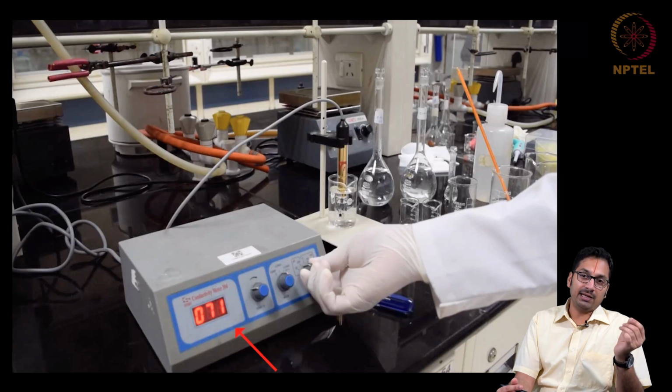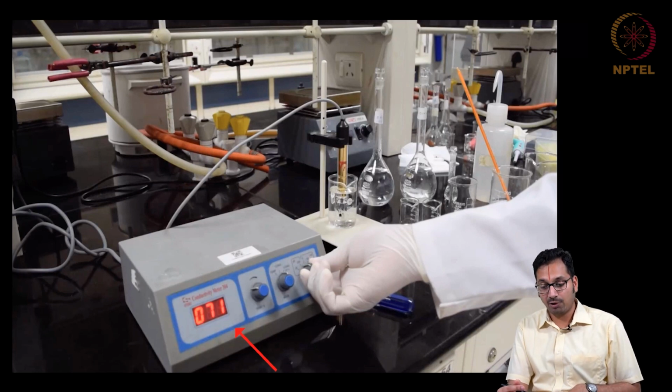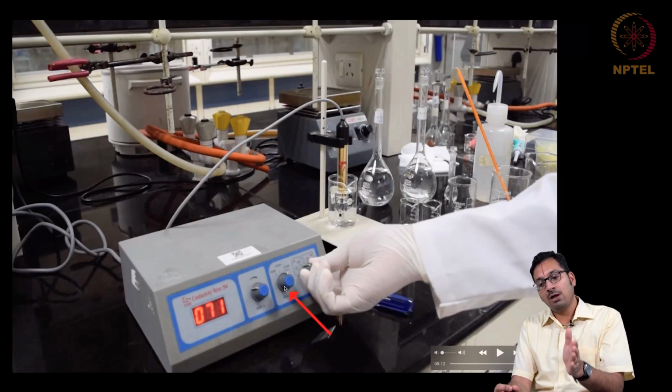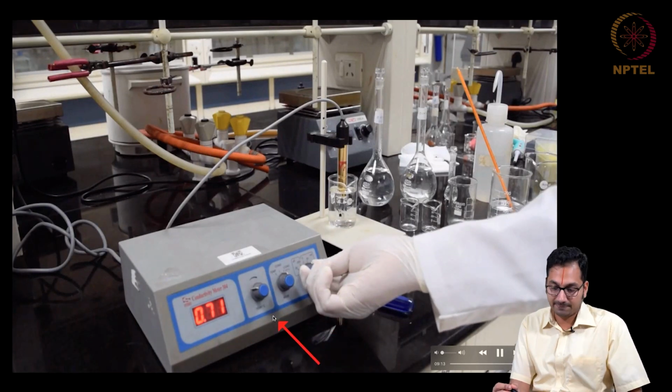So this is something that each one of us must have in mind before making a measurement. What is the correct value at which you should be measuring this? We will see more of this instance as we go forward. Of course, one can always argue, instead of keeping at a 200 microsiemens, what will happen if I keep it at 1000 microsiemens, basically 1 millisiemens. We are going to see that in a moment.